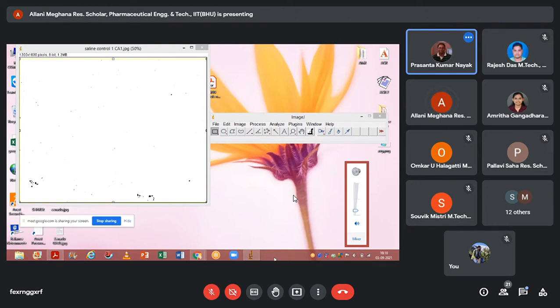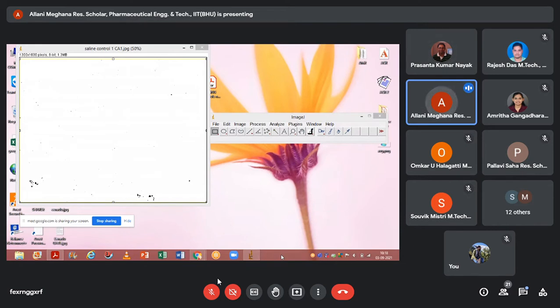Hello, guys. Just a modification a little bit. Instead of selecting the black areas, dotted areas where you can see visually, we ask the computer to select. Computer will see where the black dots are there. I think I have made a mistake in this section, sir. Yeah, you have to improve that. Again you modify your results. I'll do it, sir. Please continue.